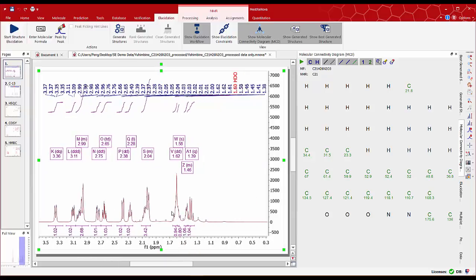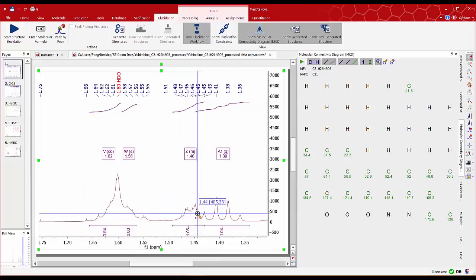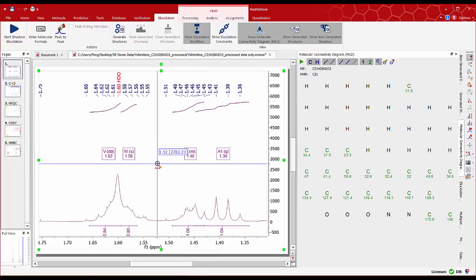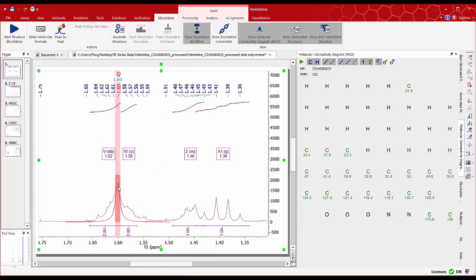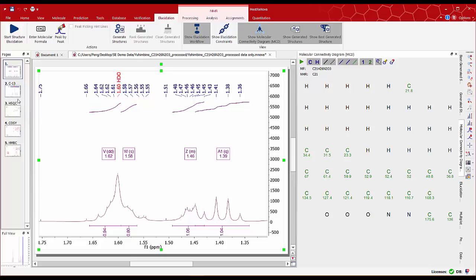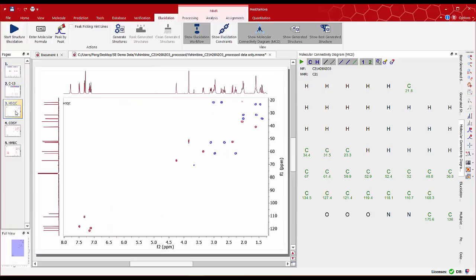Checking more closely the area around 1.6 ppm we can see how the tallest peak has been assigned as a water peak but that's not right. We can check on the HSQC that we have a correlation so the whole signal should be integrated by 3 protons.